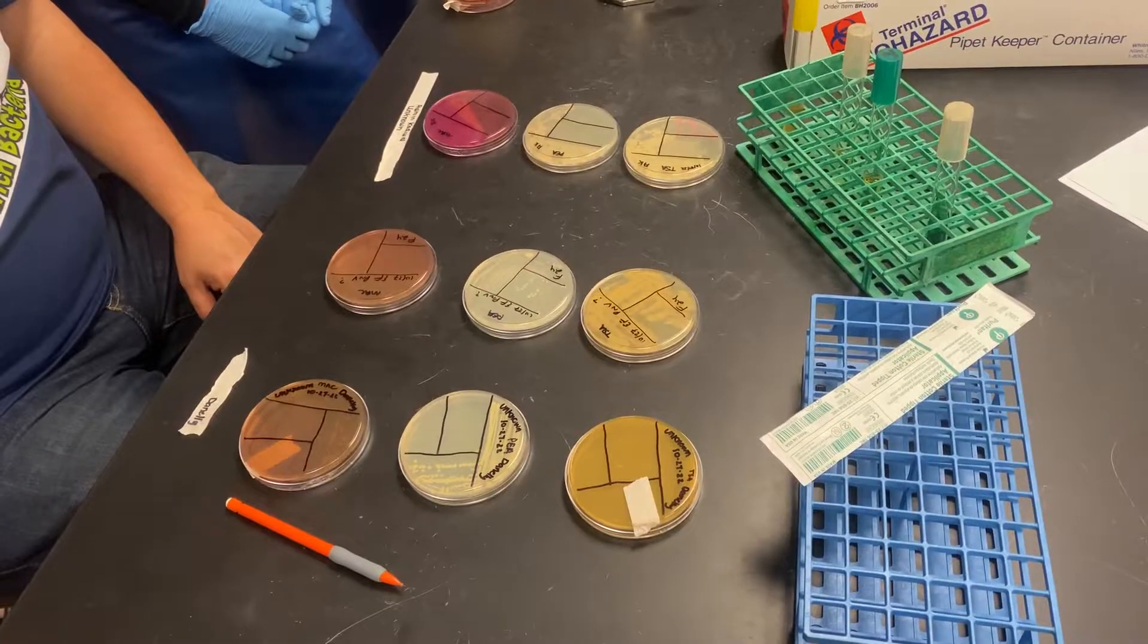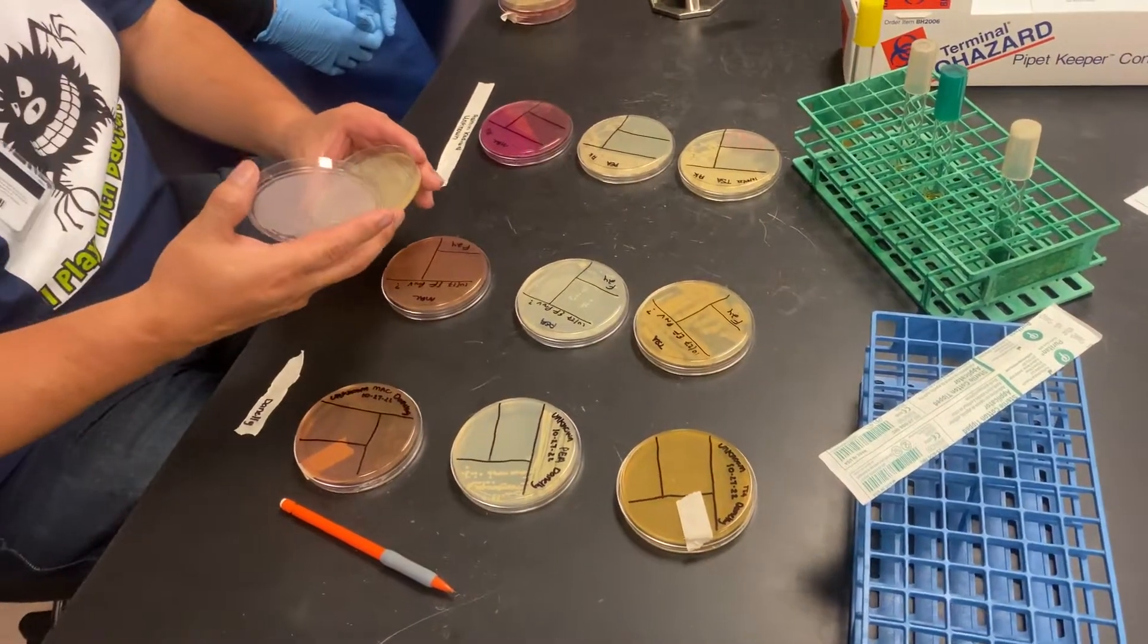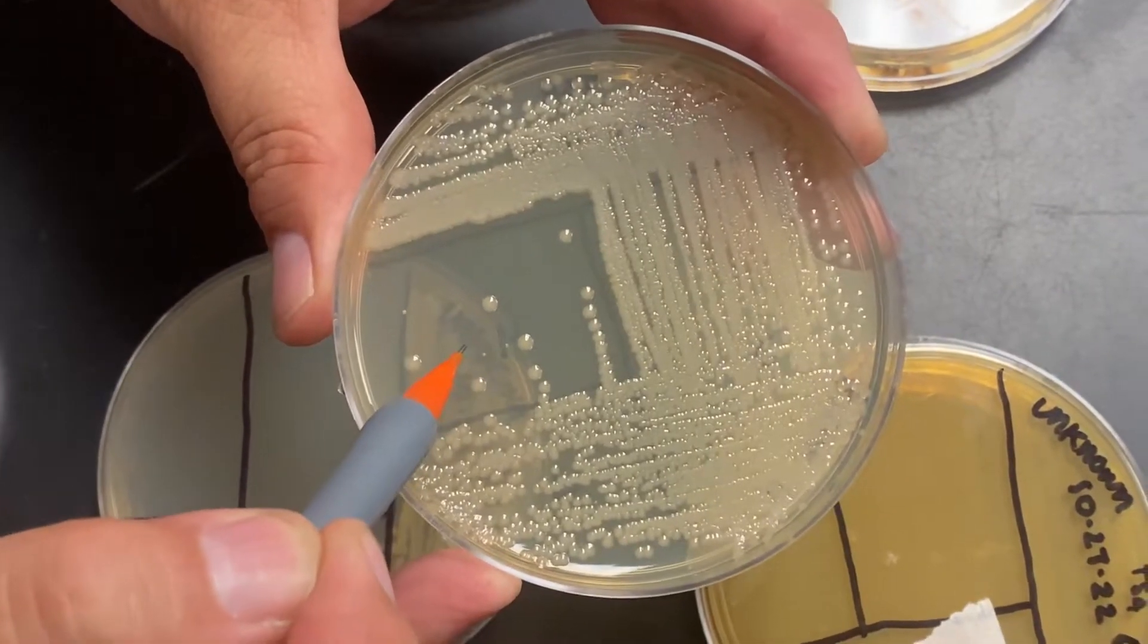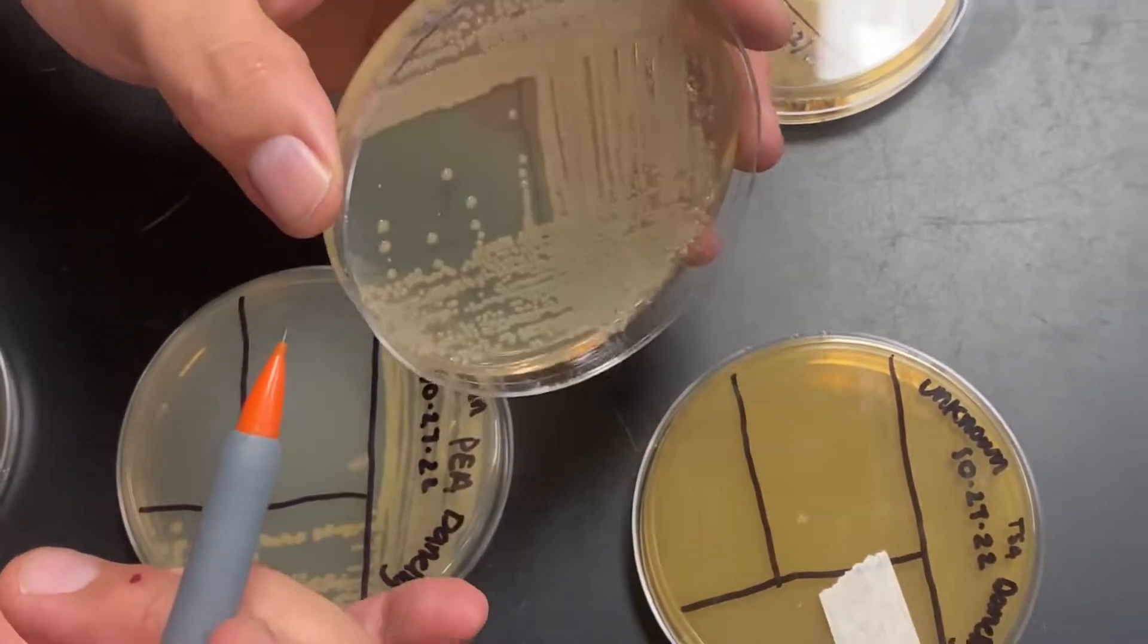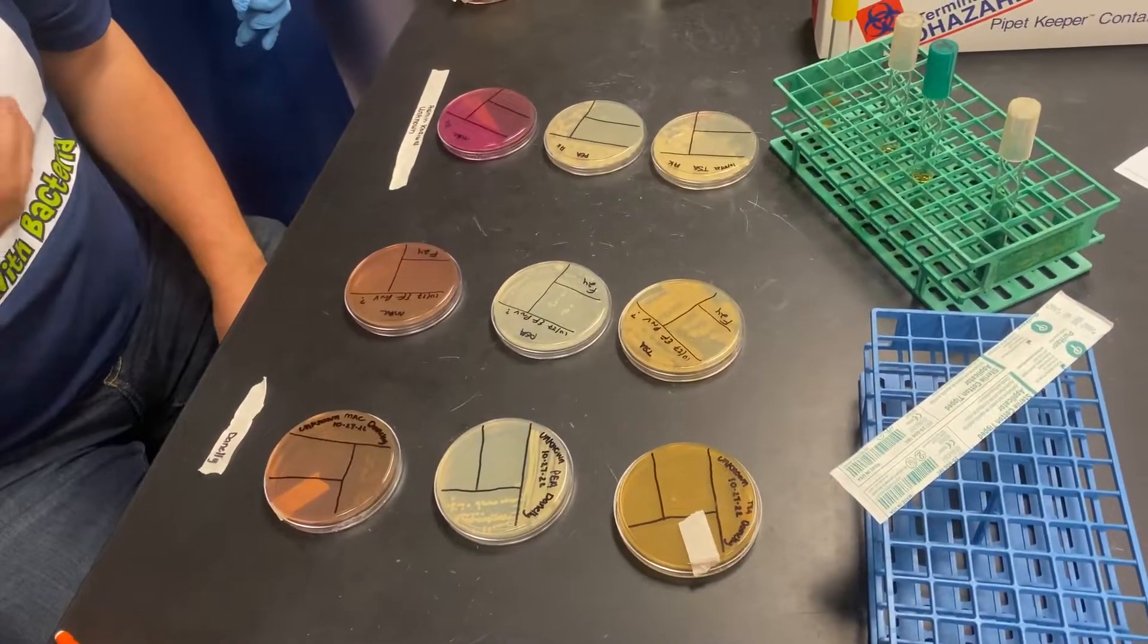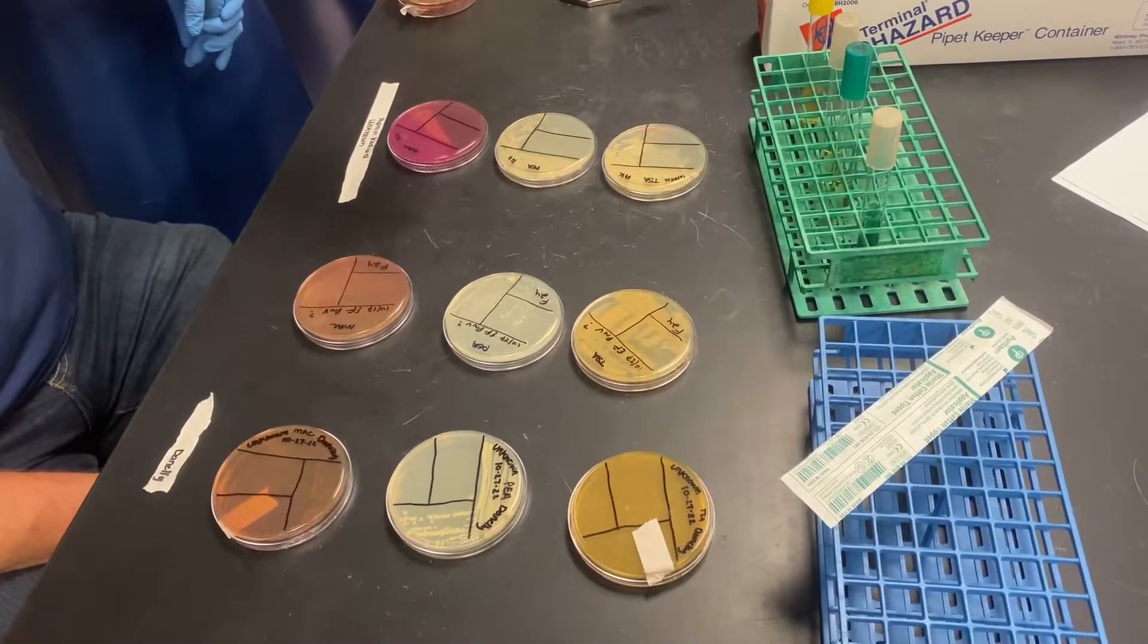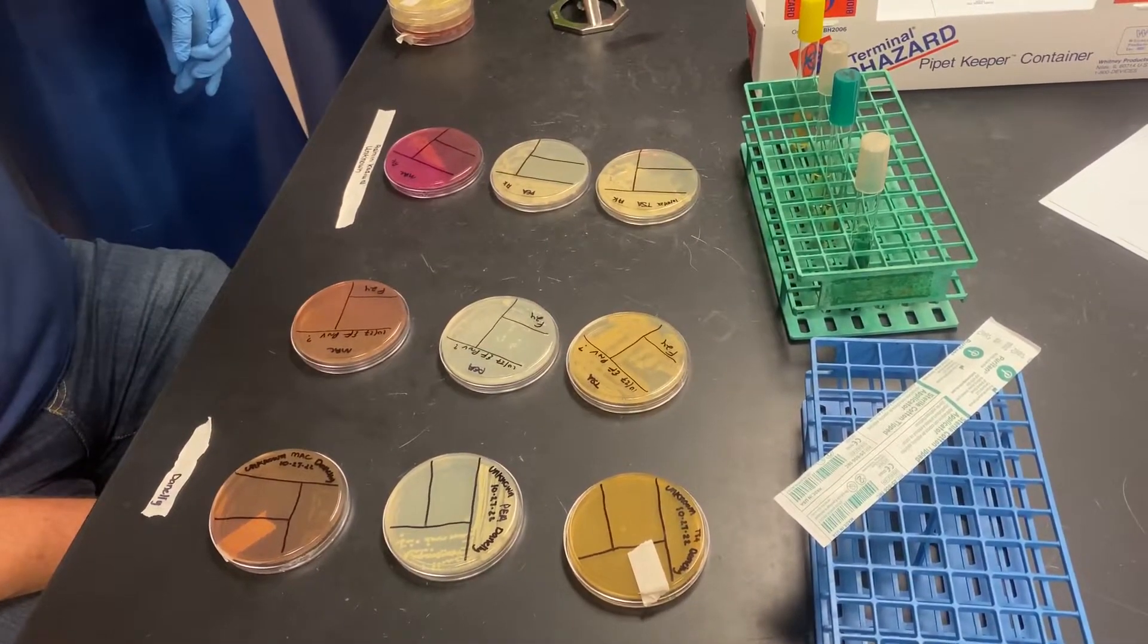Ellie, can I see your plate please? Not that one. Either TSA or... So if we look here, you can see that here you have two organisms. You have this large organism and then you have this little tiny one. So to me, she doesn't have enough of the little small one. So she should take that thing out of there and grow it on a plate so she has a whole bunch of it because that's the other one she needs to identify. So if you also have that, that's something else you have to do. You have 15 minutes to accomplish this. Doing this EMVIC doesn't take you but two. So then you have to decide whether or not you have enough organism to finish what you need to do. And so that's where I leave you today with those instructions.